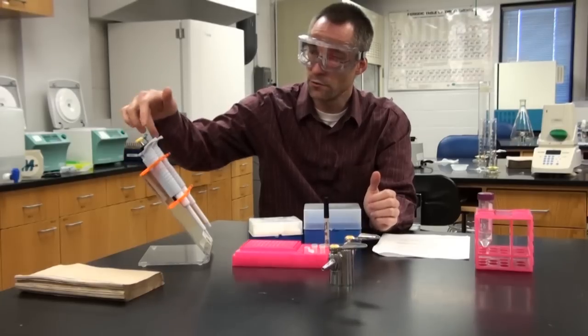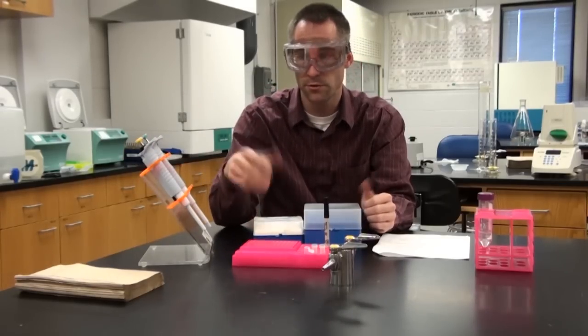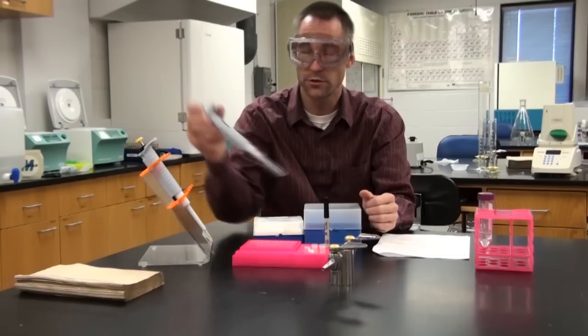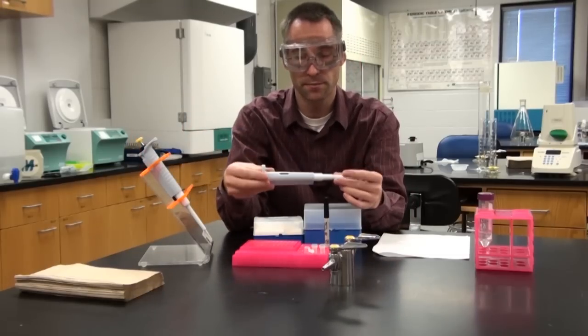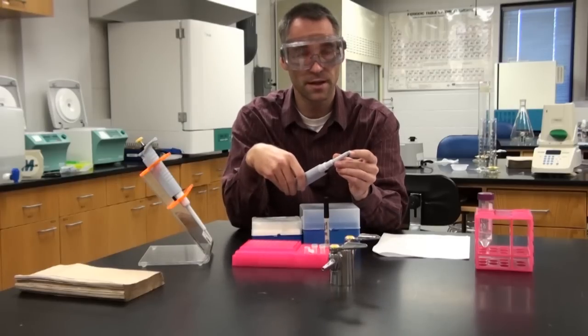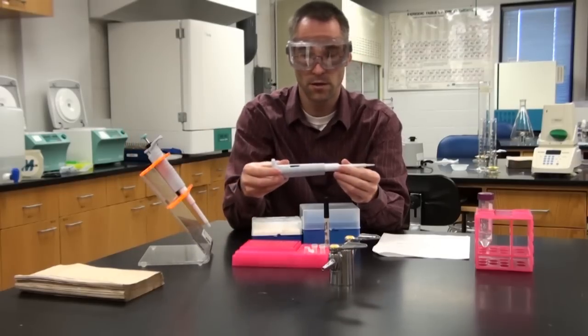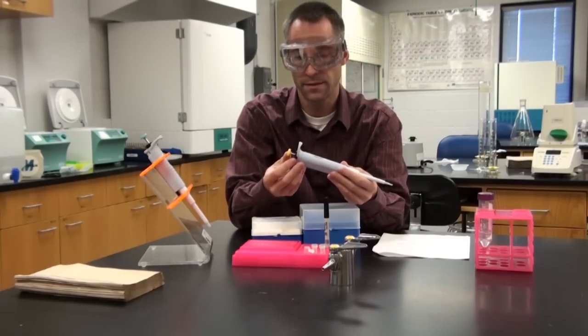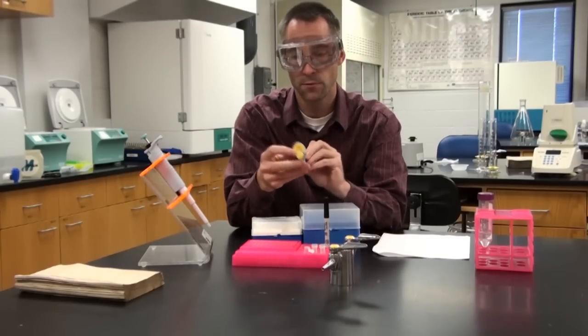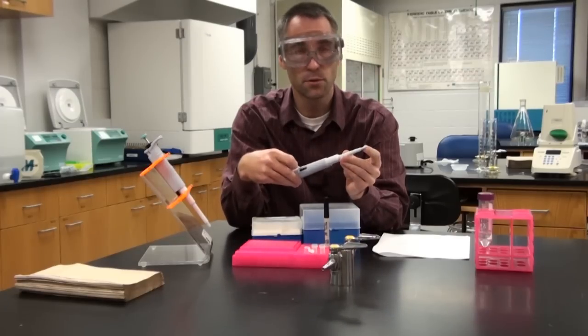You'll also have two micropipettes. You may have three at your station, but we'll use two. One will measure one milliliter or 1,000 microliters. It will have a blue top here and also a larger diameter tip on the end. You'll also have what we call a P20. It has yellow on the top and it will measure 2 to 20 microliters and it'll have a nice point on the end.